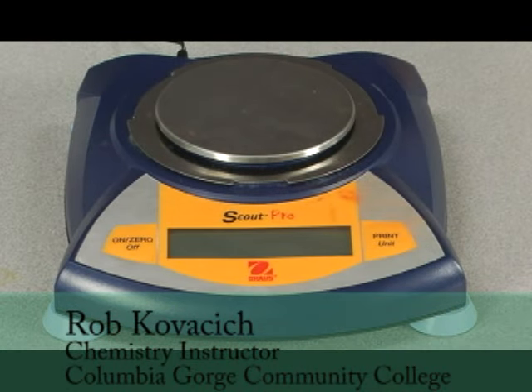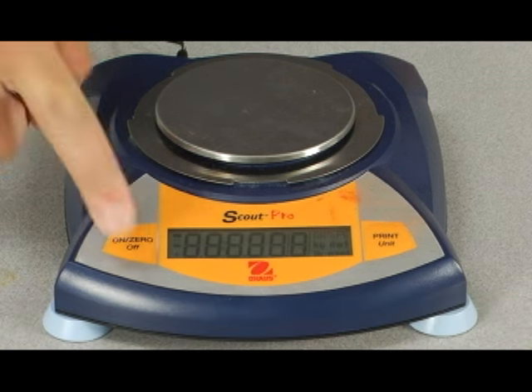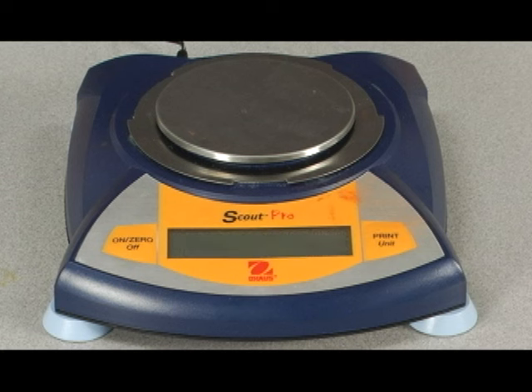This is a demonstration of the function of an electronic balance. To turn the balance on, we'll be pushing the on/zero button until you see lights. The display will go through a couple of its functions, and then when you see zeros followed by the gram symbol, that will be the indication that you're ready to go.